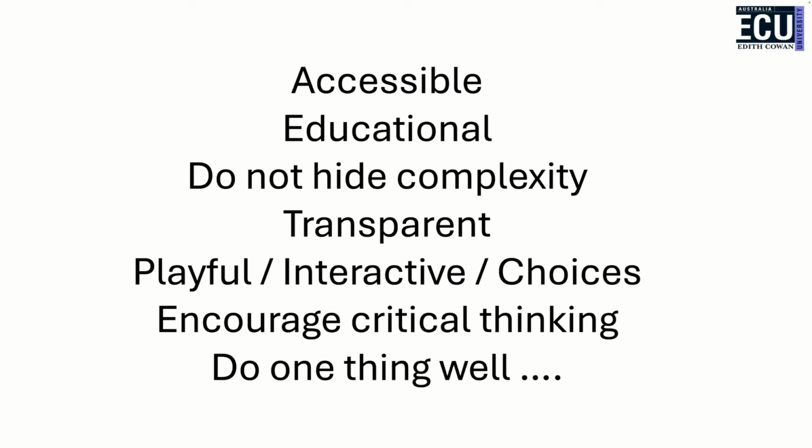But it also provides lots of choices. So for anything where it's something of real importance, there's always an alternative. So we have the spline correction, but I wanted to have the linear correction or no correction, so you can compare. When we're doing the missing value imputation for the PCA, it does k nearest neighbor, but it also does replace it with 20% of the lowest missing value. So anything where I can encourage playing around, changing method, changing numbers, changing options, I've tried to do that to encourage people to play with it and learn.